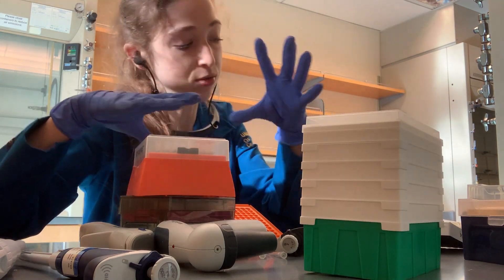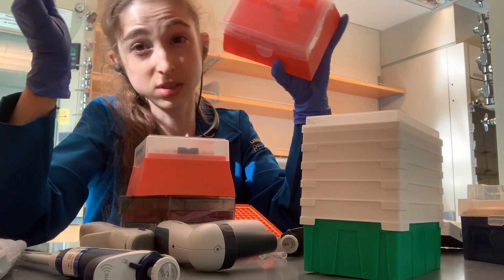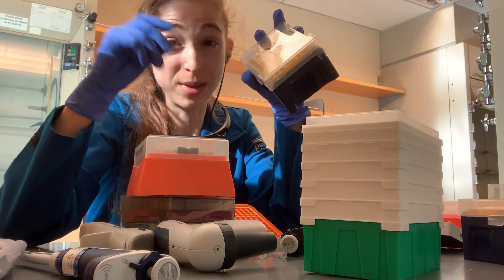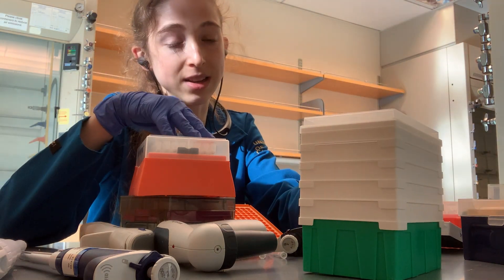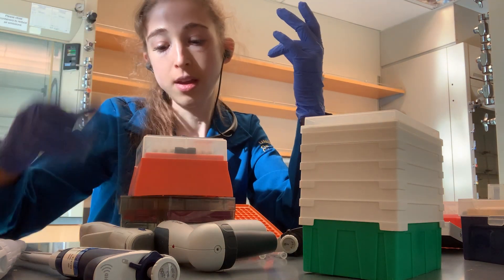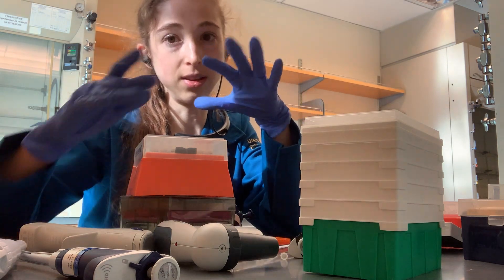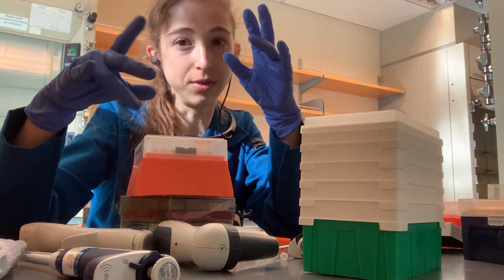You can reuse these tip boxes as handy little holders for various gadgets. In undergrad, we actually had to buy pipette tips in bulk and refill the boxes, then sterilize them. The racks make things a lot easier. So you have your racks, then your boxes, then bulk tips that are just individually packaged. Note that tips from different brands of pipettes are typically usable with different brands — they're fairly standardized.